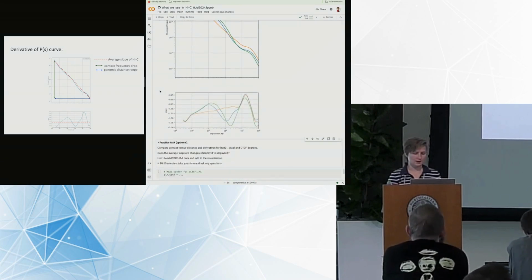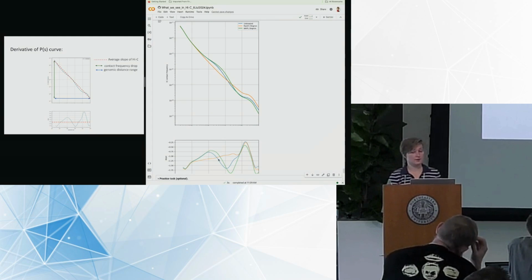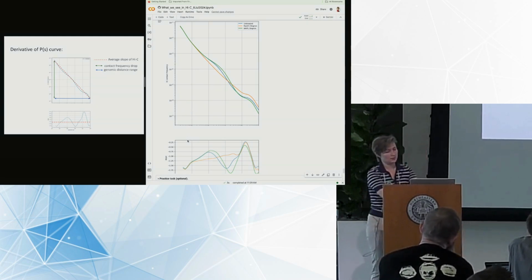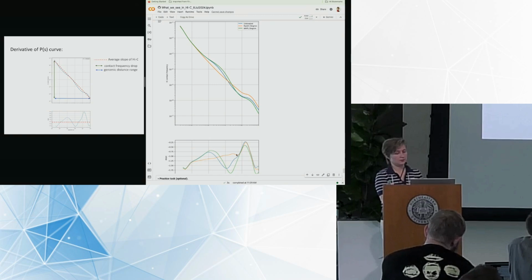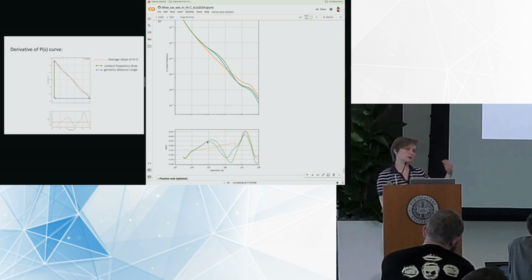So here are the different treatments. Blue one is untreated with the nice scaling hump. The orange one is Rad21 degradation, and now you can see how different this plot is and how flat it is at the distances up to megabase pair and longer. And basically that is the sign of loop extrusion being absent in your data, that there is no more increase of interactions at 100 kb, which is the typical distance for the cohesin action. It's all gone in Rad21 treatment, and that can be nicely visible in your scaling plots.